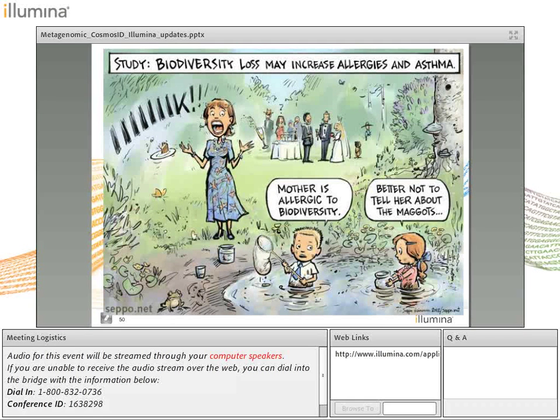And actually talking about diversity, does your database comprise the microbes that you find in the human microbiome versus environmental, and do you have both in the database? We have both. Our current database does have most of the major organisms from the human microbiome, and we have some environmental organisms, but we're also expanding our database to include a wider range of more environmental organisms as well.